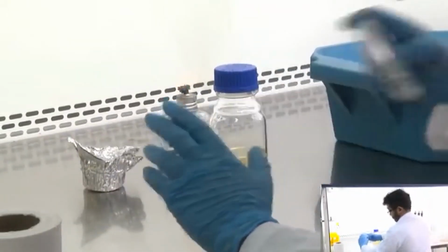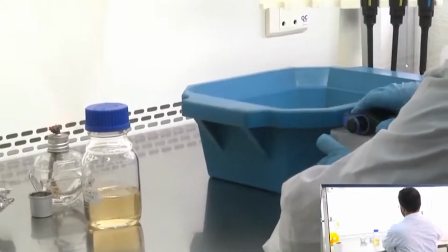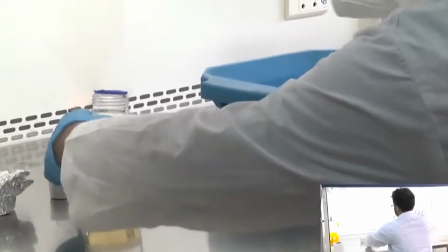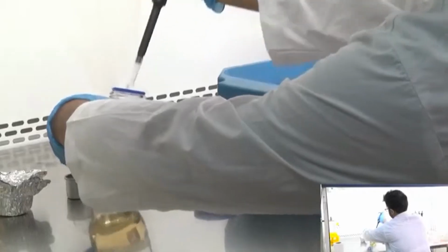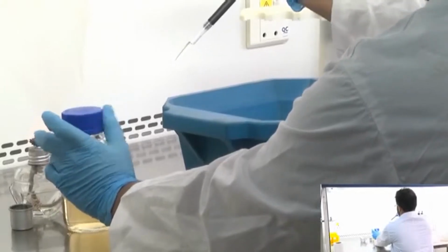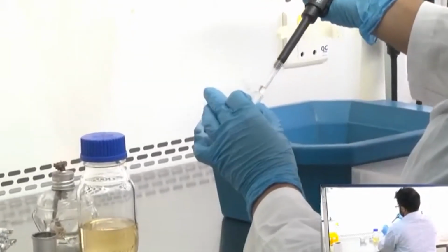I will just stop the timer, and now I will take 450 microliters of this media. Now you can take out your bacterial cells.